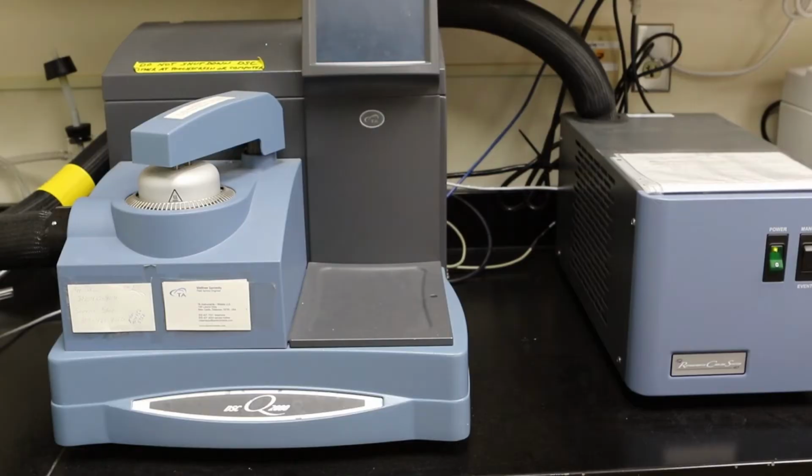We train them on what's called a Fourier transform infrared spectrometer, or FTIR for short. What that instrument looks at is the chemical bonding within a material and tells us again about structure and how materials bond with each other, or compositional attributes of the material.